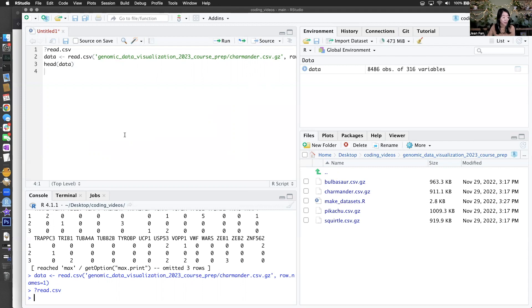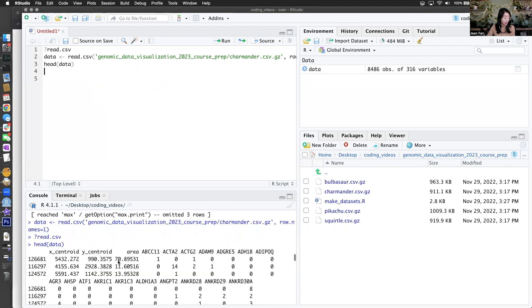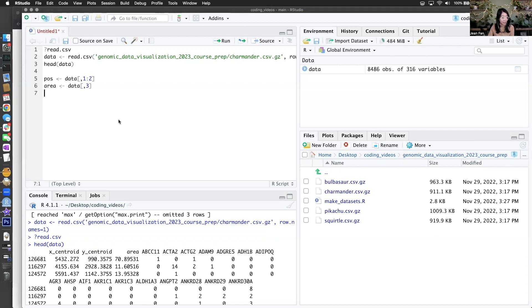I've named the data sets after Pokemon, but we'll see if any of the students actually know what Pokemon are. So I just read in the data, and you can see that the rows are cells with IDs, and the columns are things like the cell centroids, area of the cell, and then these are all the genes. I'm just going to reorganize it a little bit so that I can have everything renamed into variables that are more consistent with what I want to do downstream.